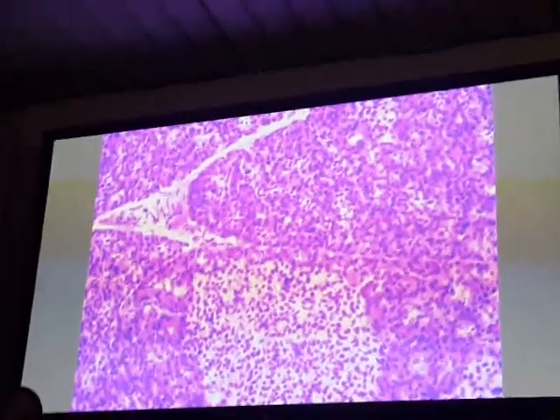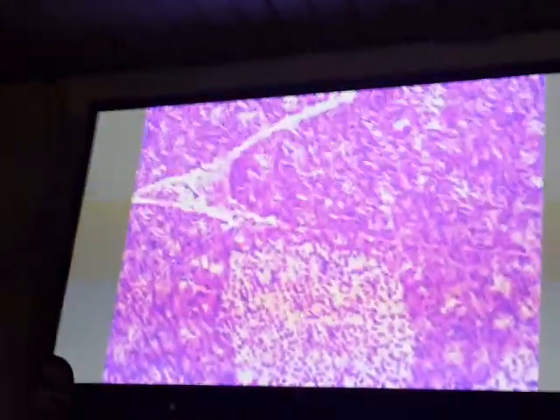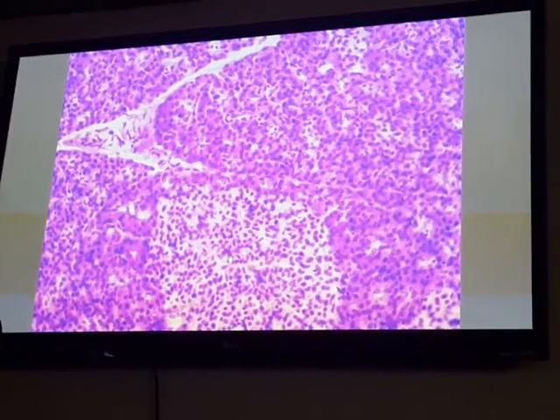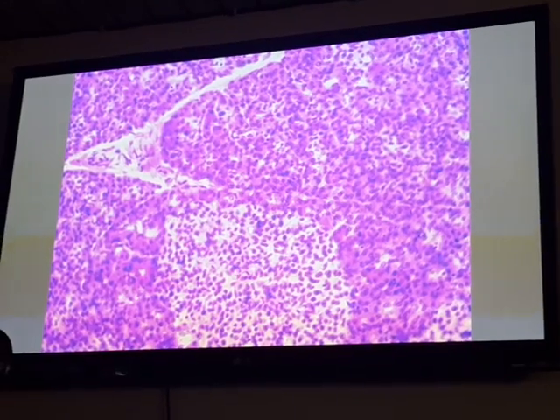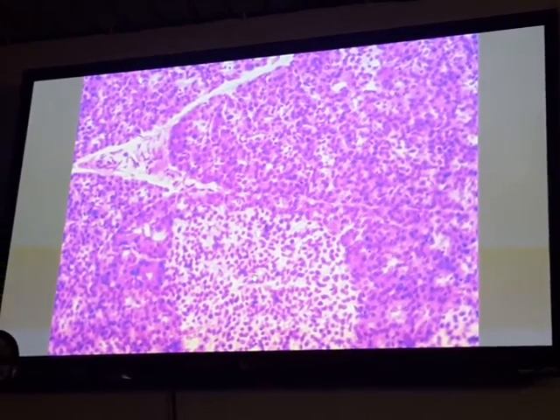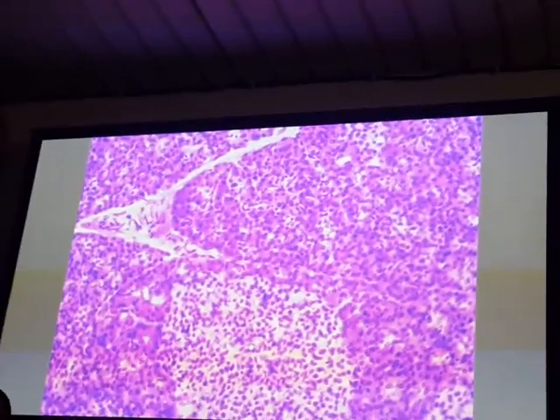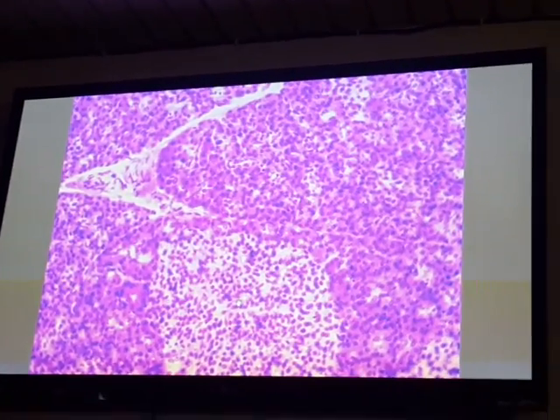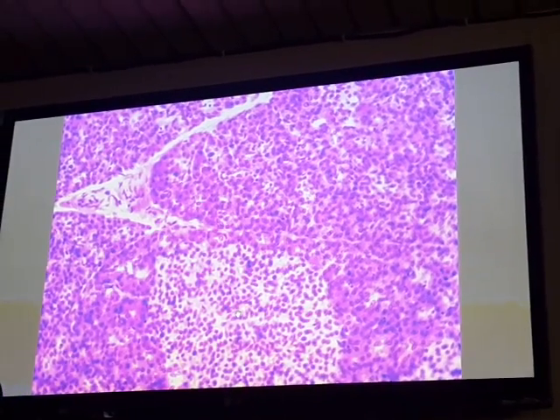This is exocrine portion. This is endocrine portion. The pancreas is similar in structure to the parotid gland, but differs. What are the differences between them? We took them in the first semester. There are no mucous cells. The absence of striated duct and the presence of islets of Langerhans.